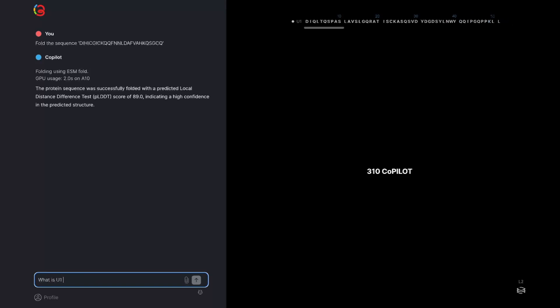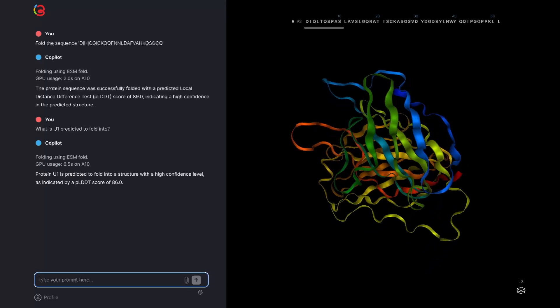Here it's called U1. Now that we have U1 we can ask Copilot to predict the structure of U1.